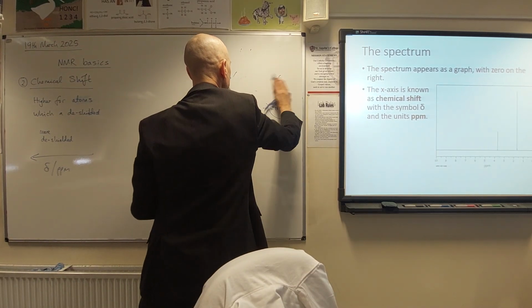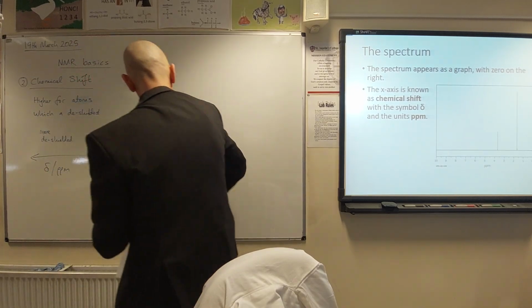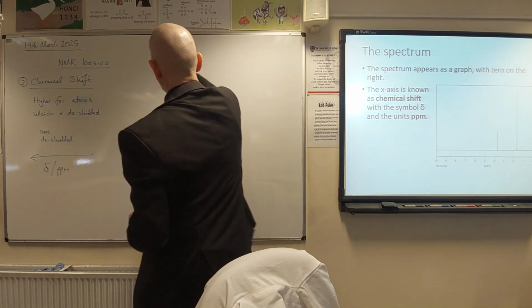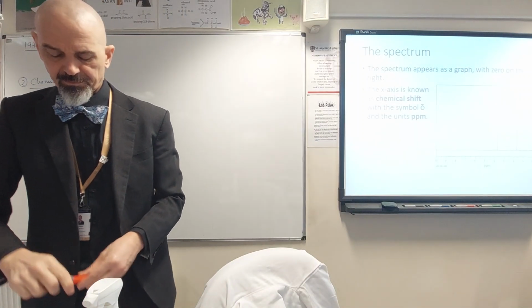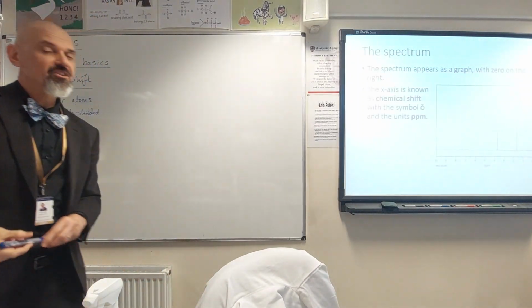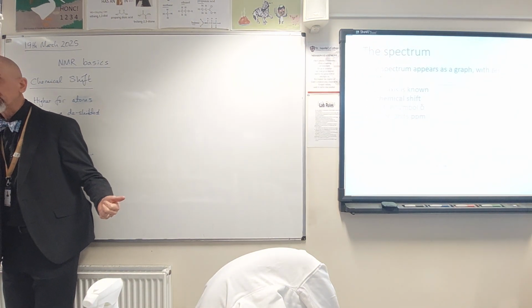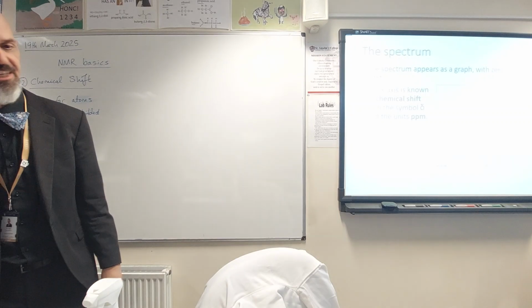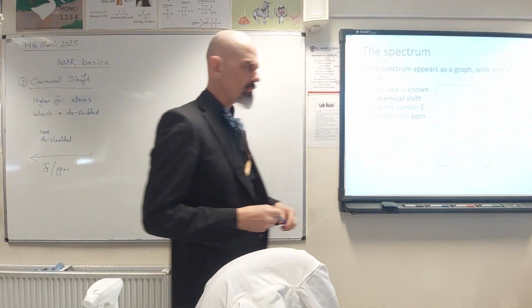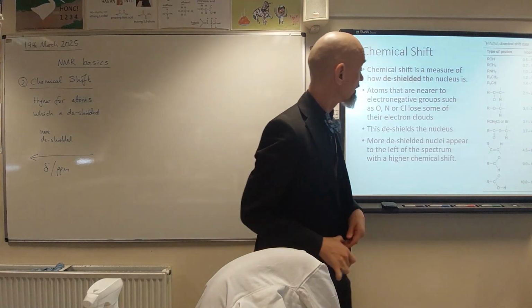So all of that makes NMR quite useful, and you should be able to identify the number of unique chemical environments and get some useful information from chemical shift data, although a quick look at that table shows you there are some blips.